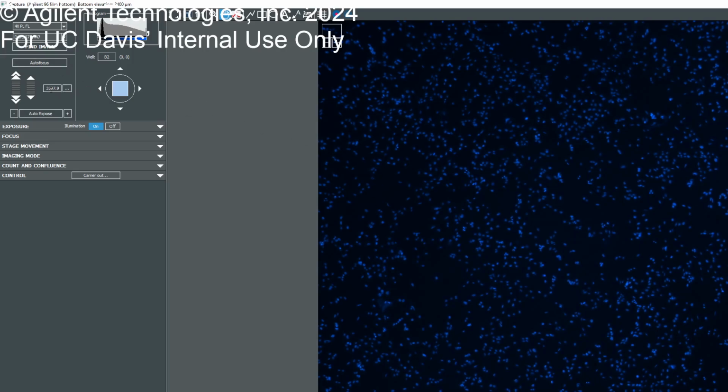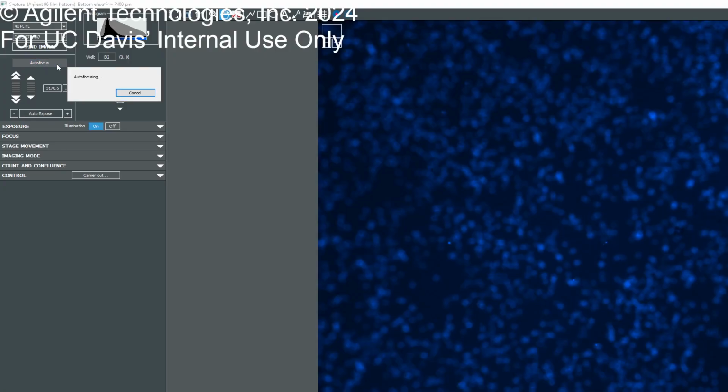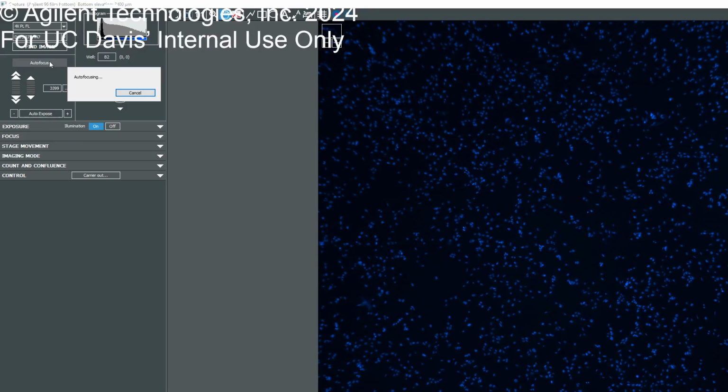And you can also look at the Z height, which is here. So it's like 3397. So if you were maybe here or something, and then if you hit auto expose and autofocus, then you see the difference. It was already good to begin with, so it didn't make a huge difference. And then once you hit autofocus, always just try to expose it one more time, because you don't know exactly what the exposures are until you are at that focus point. So you set it one more time. Oh, so always 2 cycles of auto expose and autofocus, and then more if you have to afterwards.